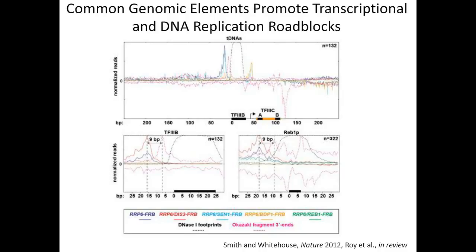In terms of quantifying gene expression, the previous webinar I think went into detail on this, and you can obtain reliable fold changes in expression by quantifying the 3' ends. For our studies, when we're looking at the nuclear exosome targeted poly-A tails, we're actually seeing a very substantial change in levels. So we actually use a cutoff of 5-fold to define something as targeted by the nuclear exosome. So it's a very stringent cutoff.